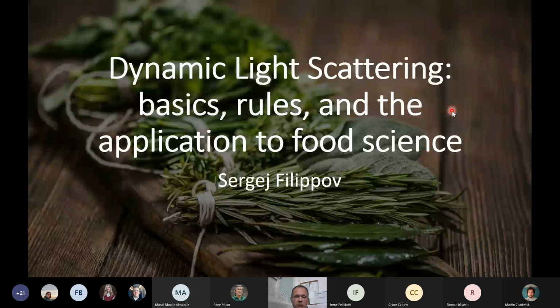The name of this method you've probably heard before this talk. It's dynamic light scattering, and my talk will be organized in three parts. I will give a very brief, very basic introduction to the method, and I will explain how this method could be applicable to the investigation of food science, and I will also share with you some hints on how to make a decent dynamic light scattering experiment with your samples.